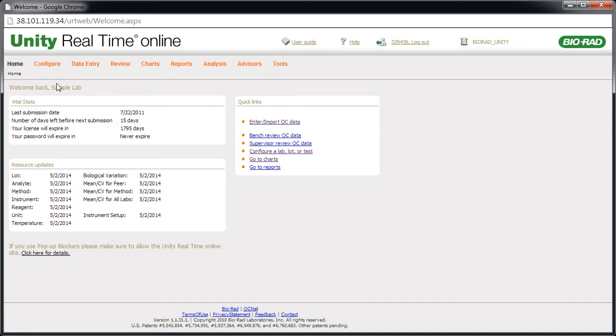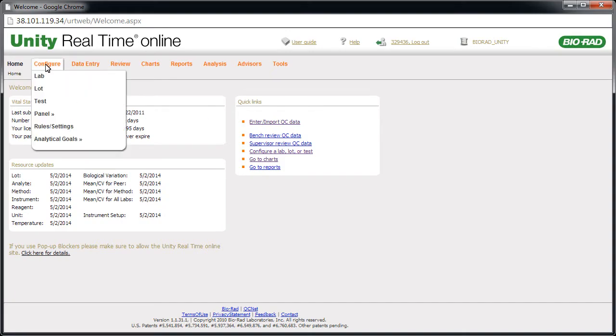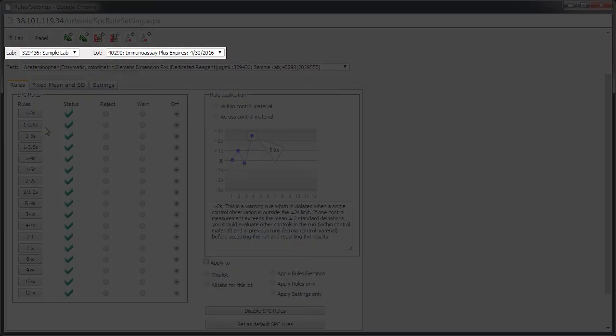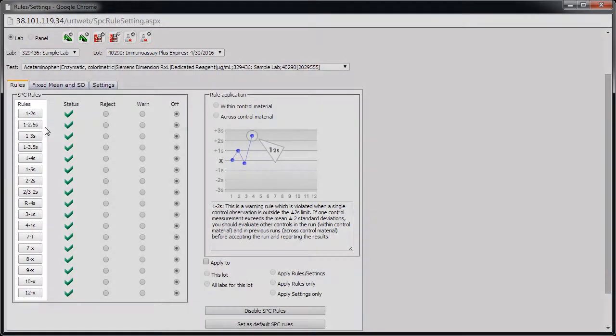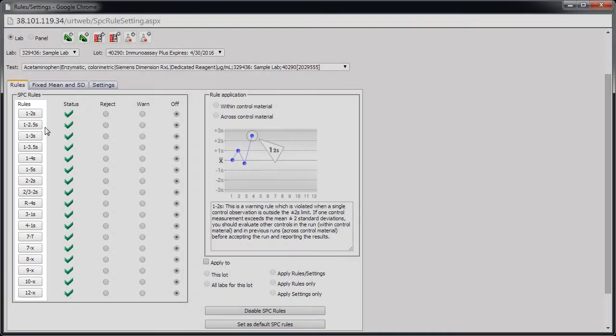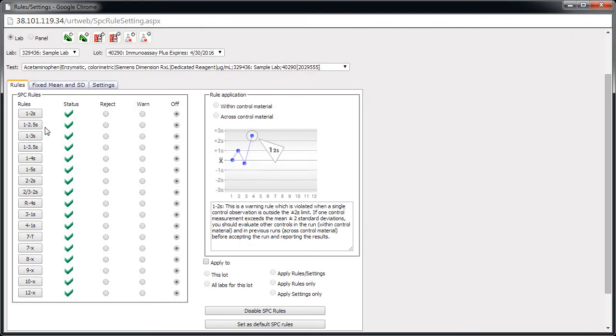Let's start with setting up rules at the lot level. Point to Configure, then click Rules Settings. Let's take a look at the various parts of this page. Select a lab and lot number to set up rules for. The Rule buttons allow you to see a description of the rule. Click a Rule button to view an explanation.